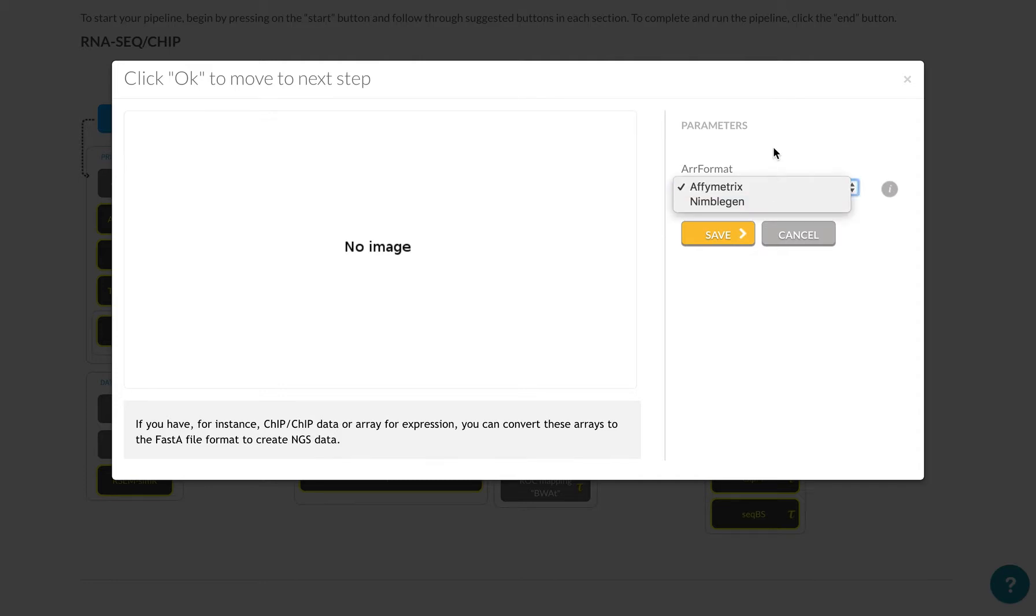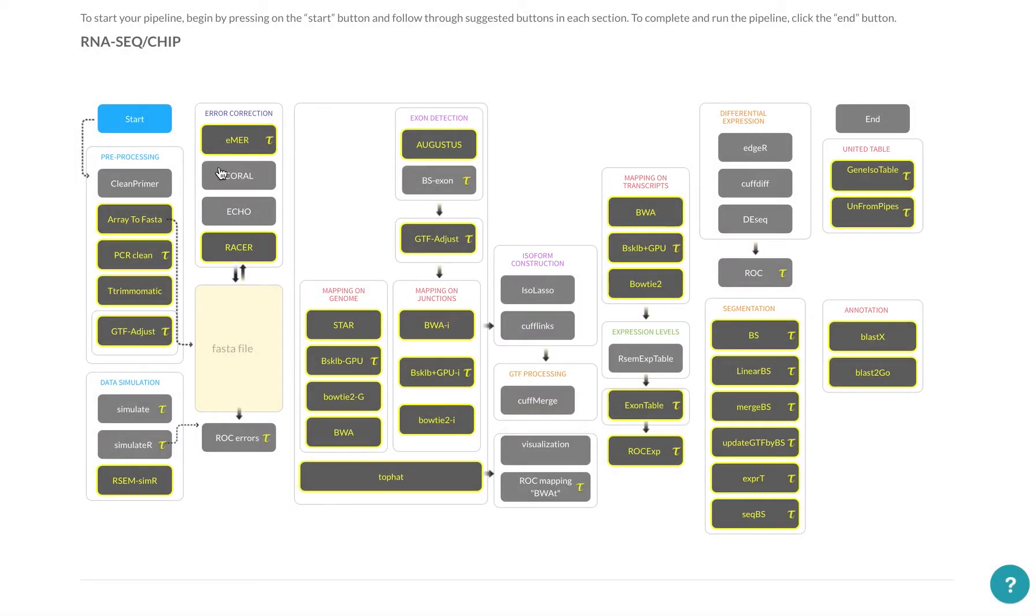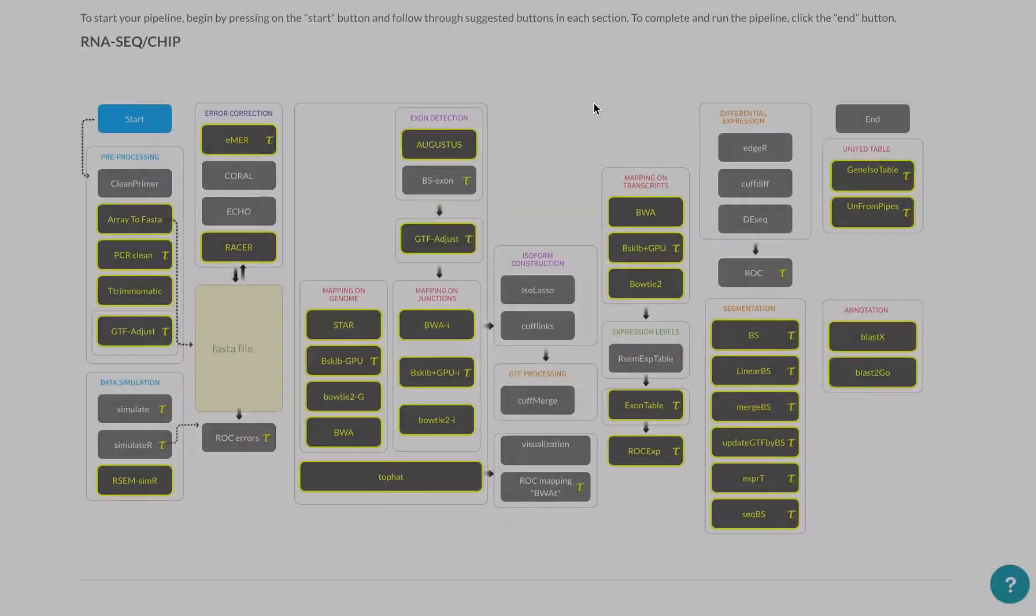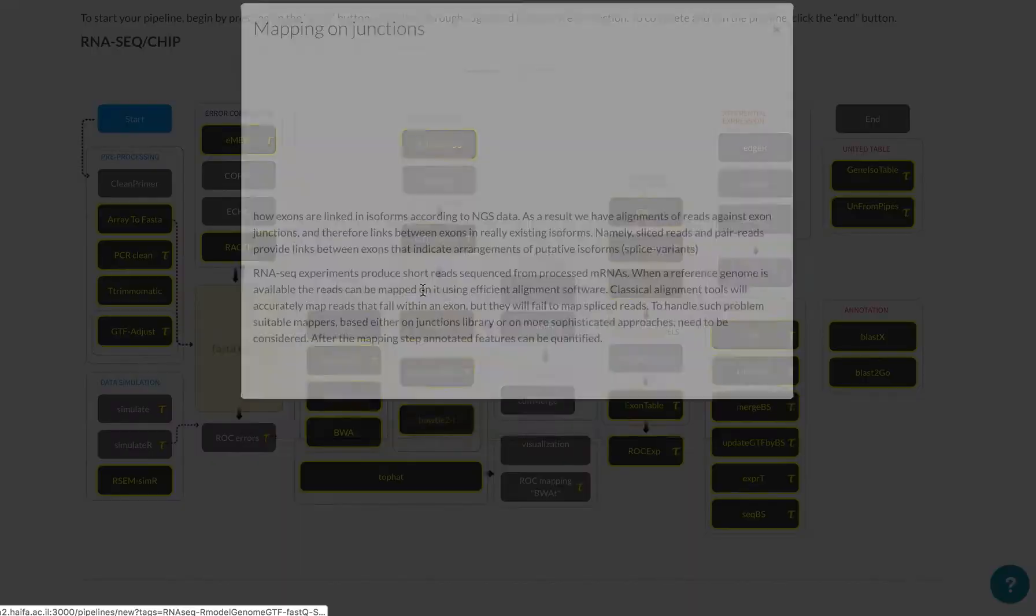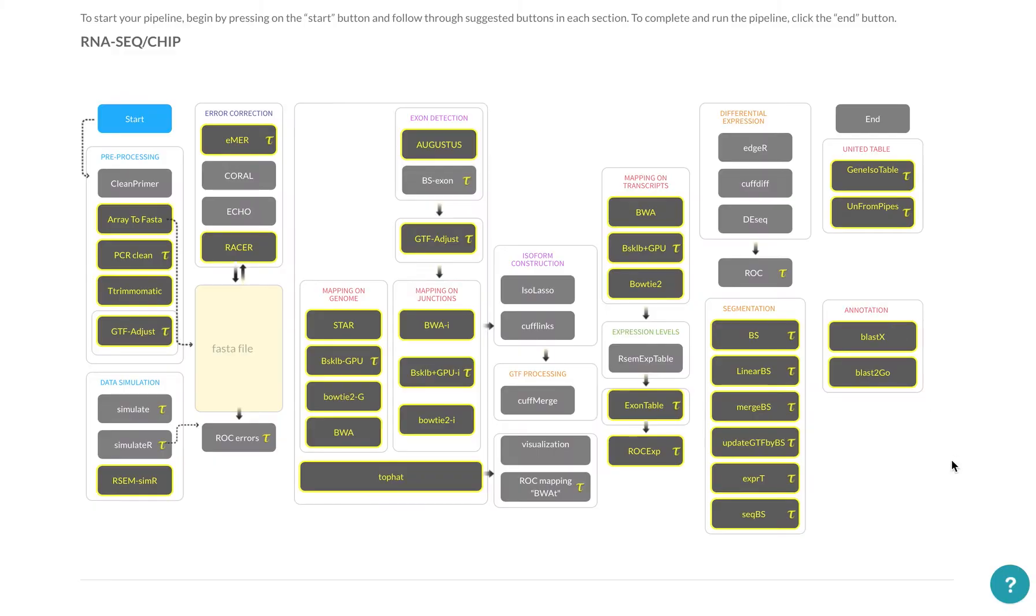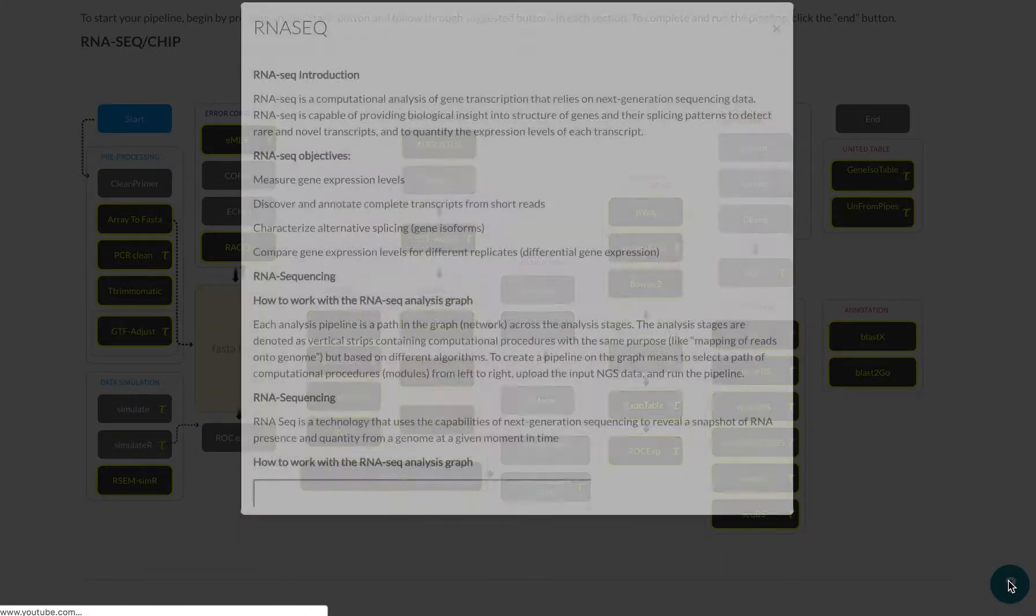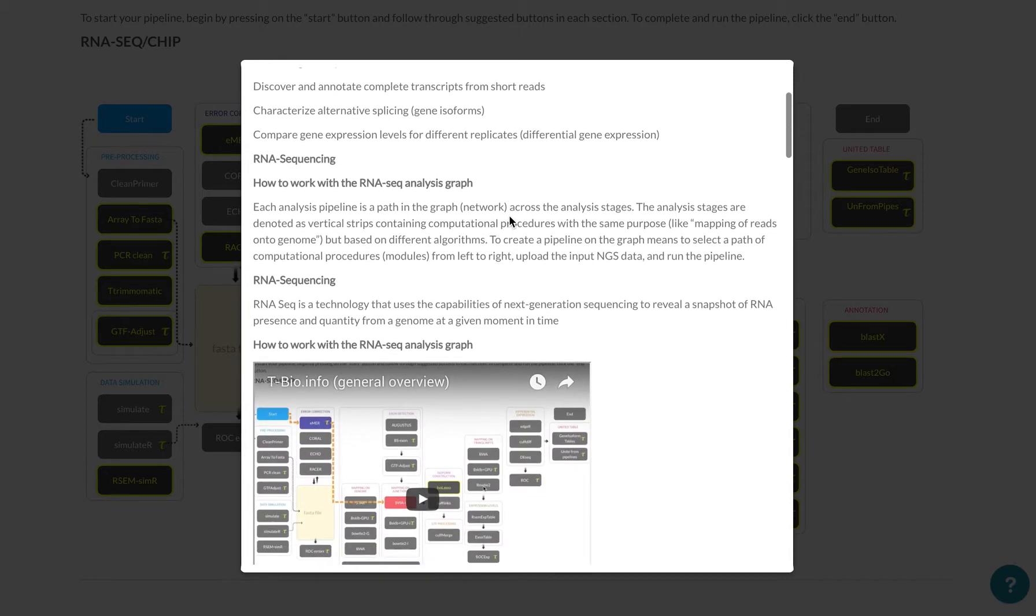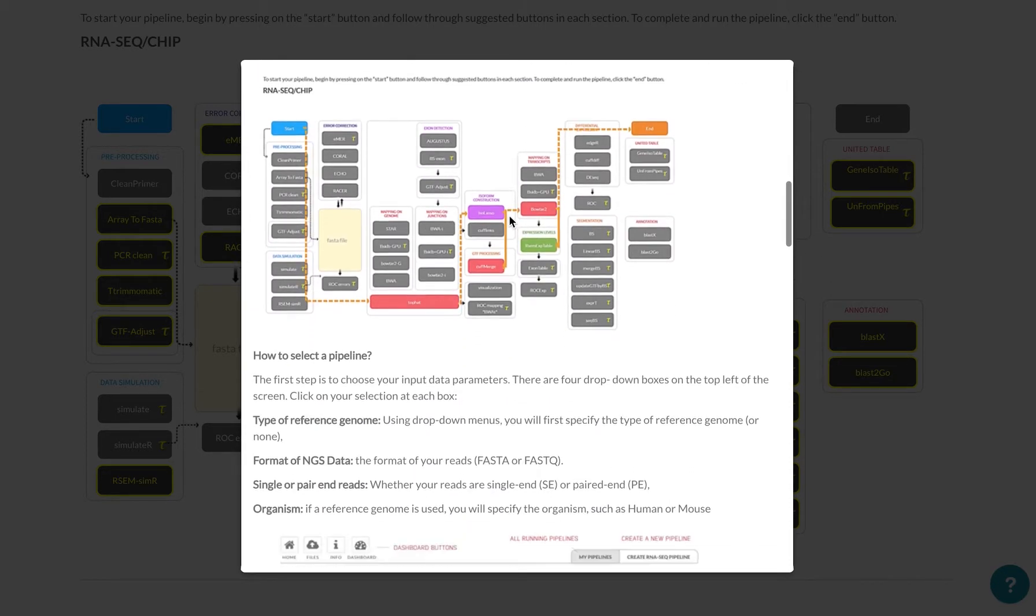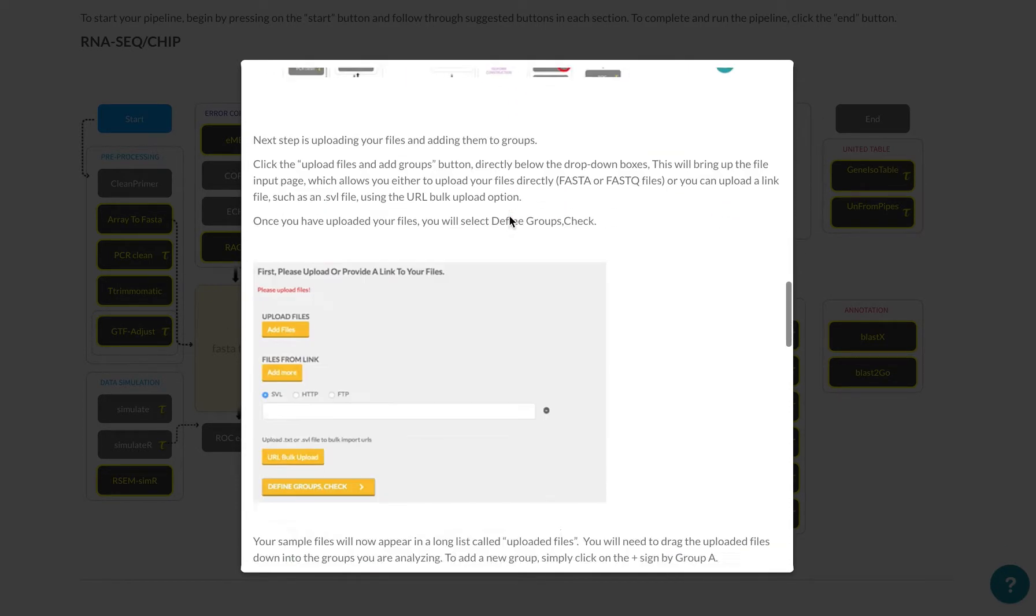Again, if you have any questions, you can go through this pop-up over here located on your bottom right corner. So the typical pipeline will include mapping. I'm going to use TopHat.